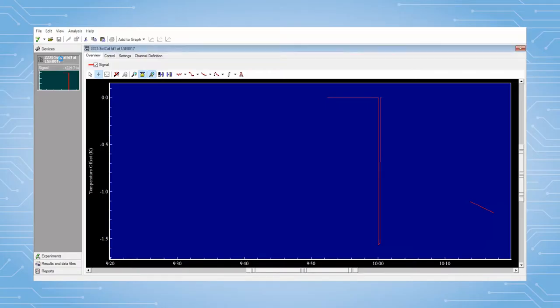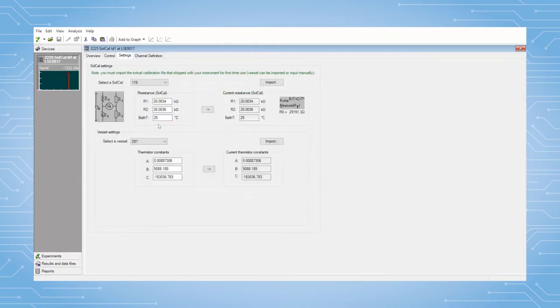In the software, go to the SolCal setting tab and make sure the temperature is entered correctly and the vessel number is correct.